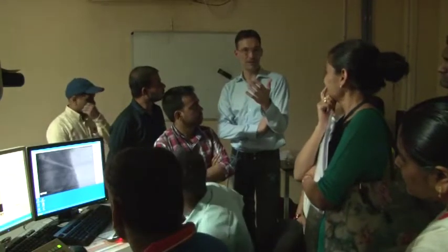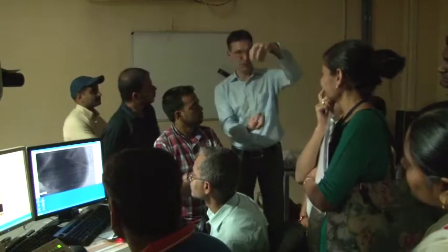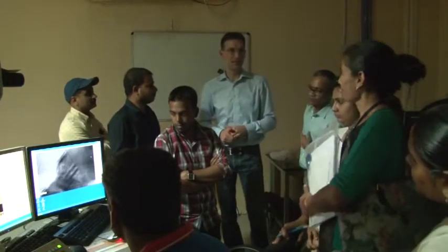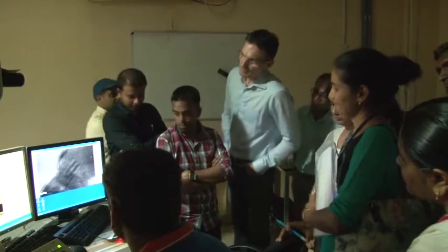In an aberration corrected instrument, that immediately causes drift of the focus of your probe, if the focus drifts up or down due to temperature rise. Temperature stability is another big deal. So he's getting it now.